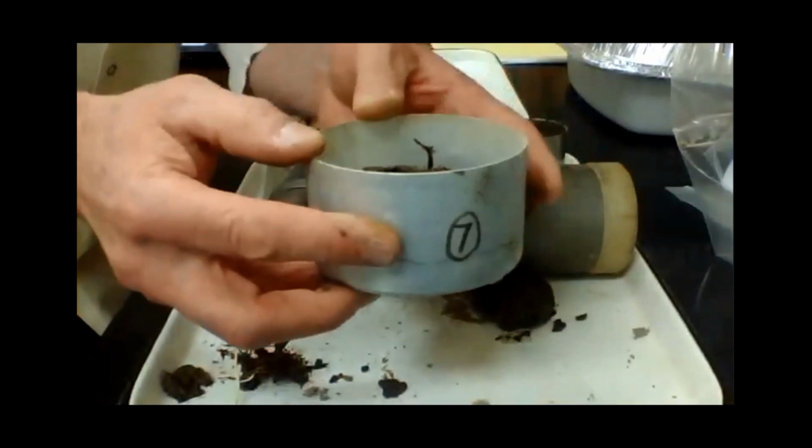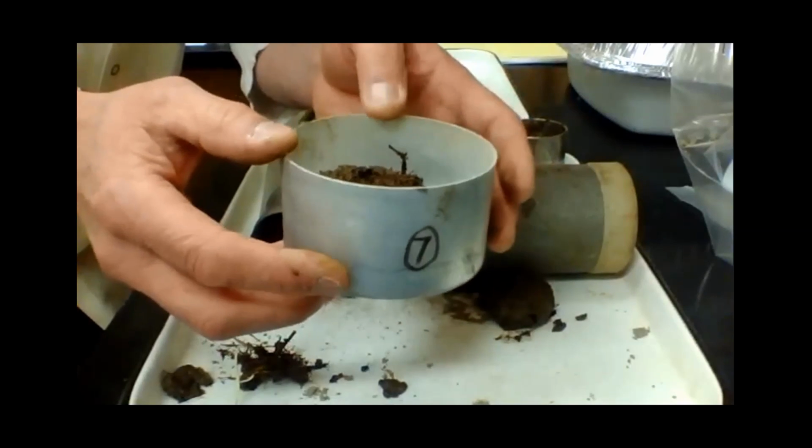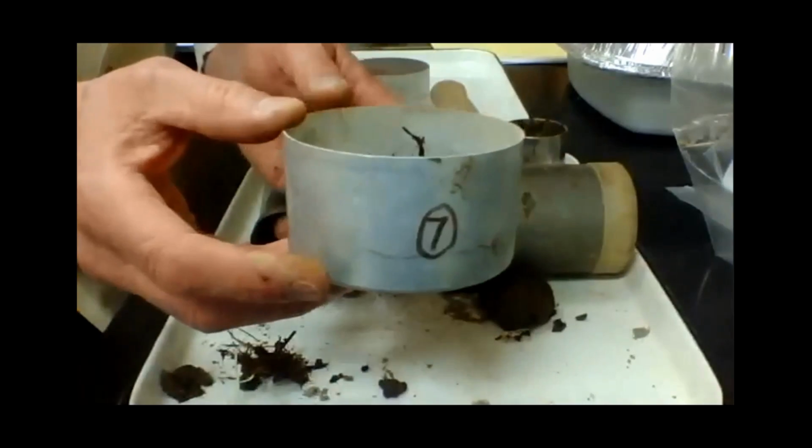The next step with this is to eliminate the water from the sample. So I'm going to move around here a little bit in the lab and take you over to the oven, and we'll put the sample into the oven.